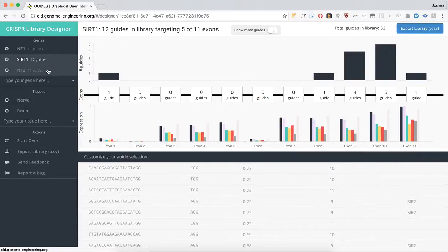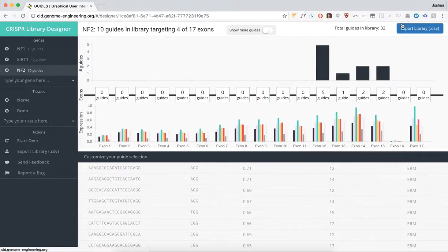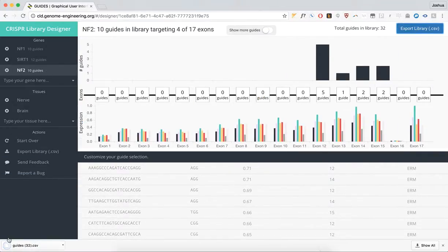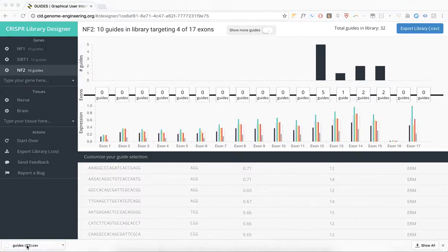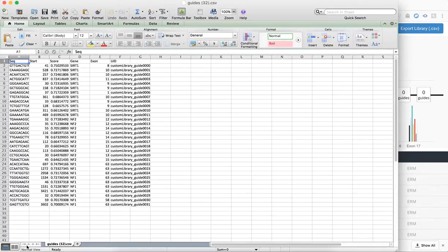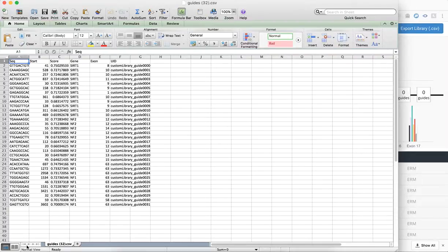Finally, when you're done, click Export Library, and you'll get a CSV with your data that can be sent to a custom oligopole manufacturer, such as Custom Array or Twist Biosciences.